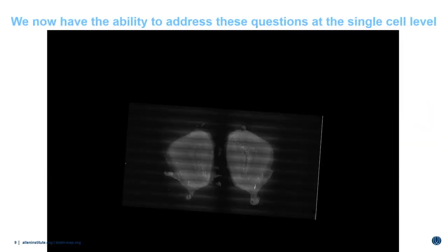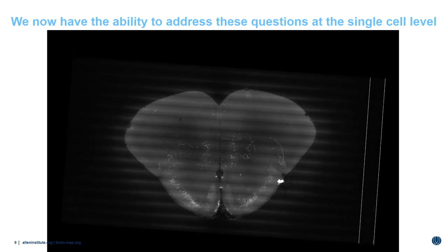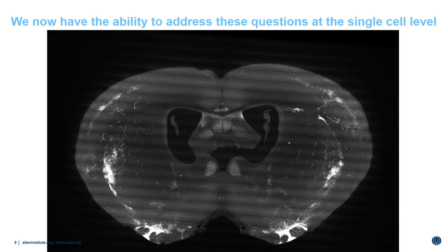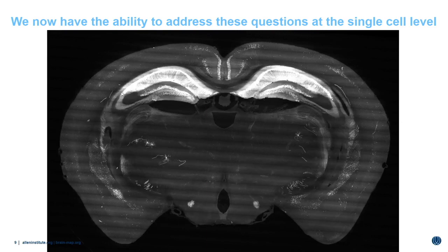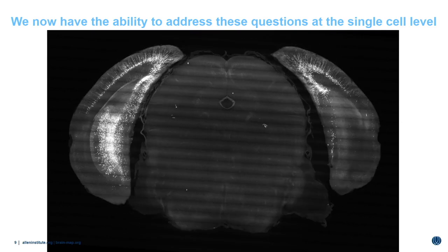And then this is a video that's going to play. Fantastic. So I just want to show you the kind of labeling that we're working with in order to generate these 3D reconstructions. So you want to kind of follow this area here. You see those, there they were, and they're gone.